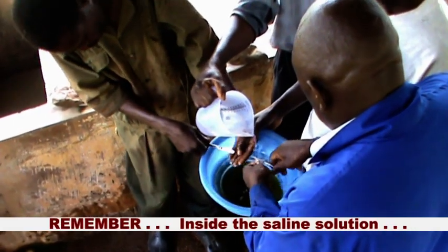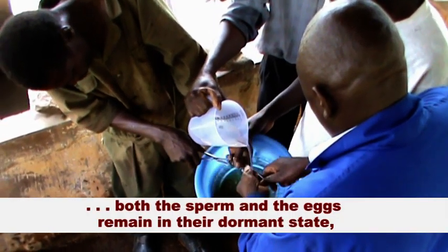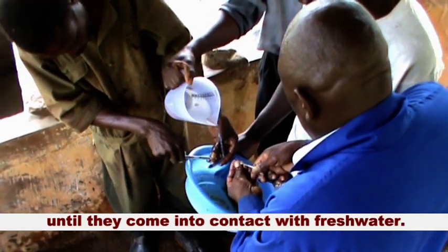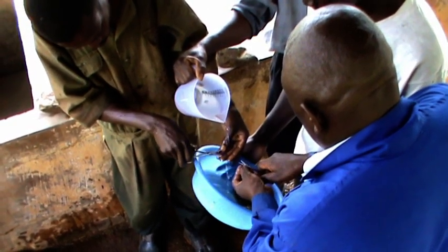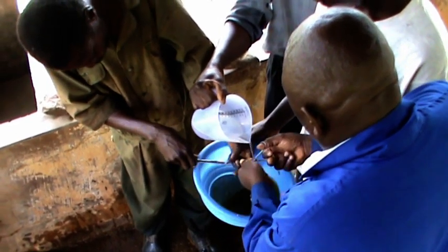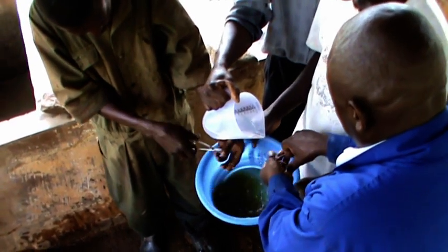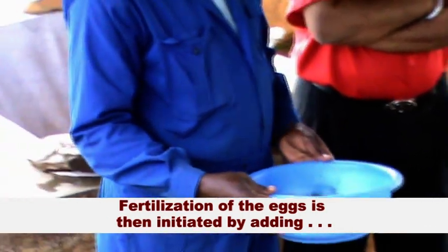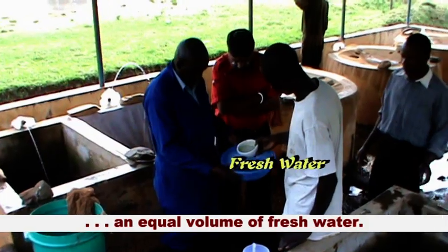Remember, inside the saline solution, both the sperm and the eggs remain in their dormant state until they come into contact with fresh water. Fertilization of the eggs is then initiated by adding an equal volume of fresh water.